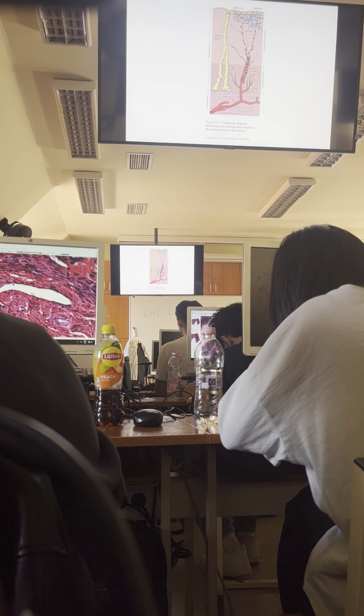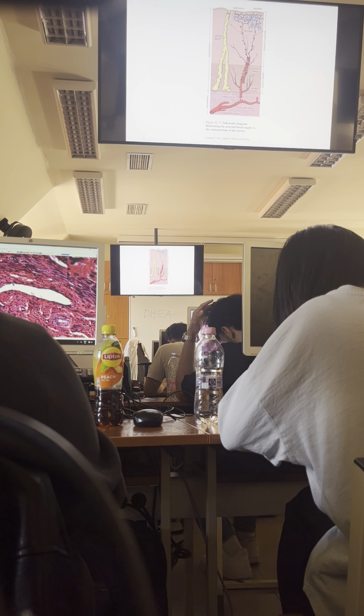And here, from the side of the myometrium, artery is coming, which is actually branches of the uterine artery. And this branch has a rather straight course at the bottom part of the basal layer, like here. But in the upper part, mostly in the spongy layer, the artery becomes spiral shaped.